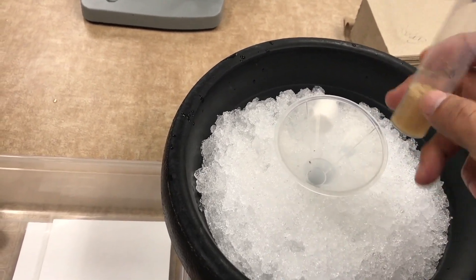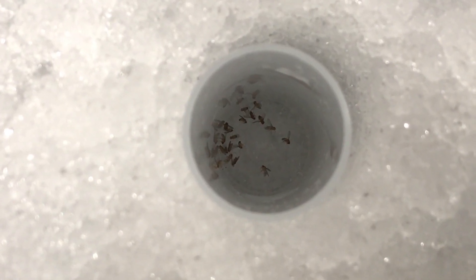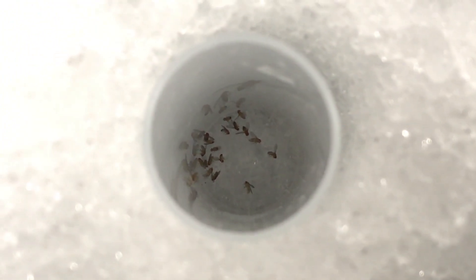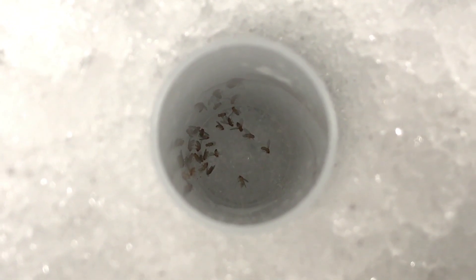In this case all of the flies are within the tube right now. At this moment all of your flies are sleeping. They are not dead — they are just sleeping because of the cold temperature.